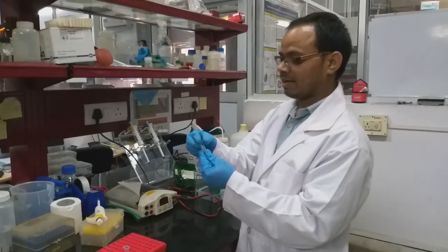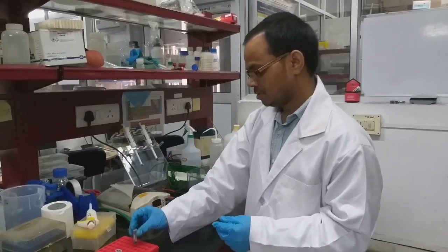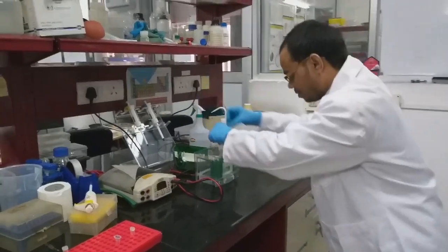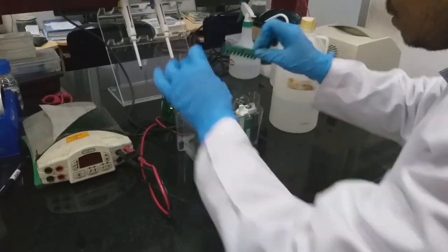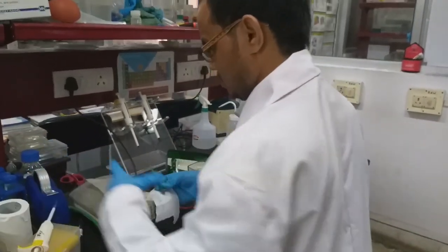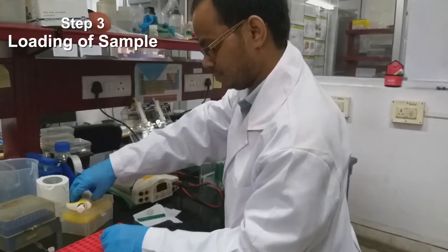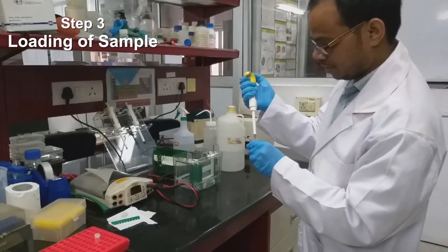The protein samples are ready. We heated them for sufficient time. Now we have to load them. So we have to remove the comb carefully. Then first I am going to load the marker, the protein ladder.